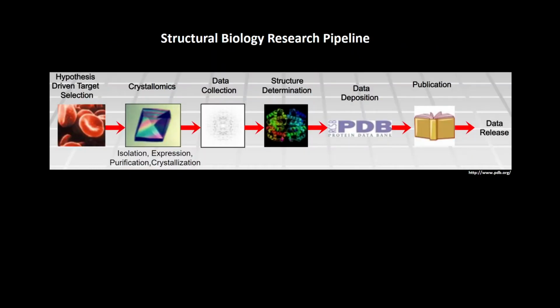Protein crystallography and the subsequent atomic level structural determination of biologically relevant macromolecules has significantly aided the understanding of human disease at the molecular level. As the knowledge of accurate molecular structures is a prerequisite for rational drug design, protein crystallography has also had a substantial impact on the drug discovery pipeline.